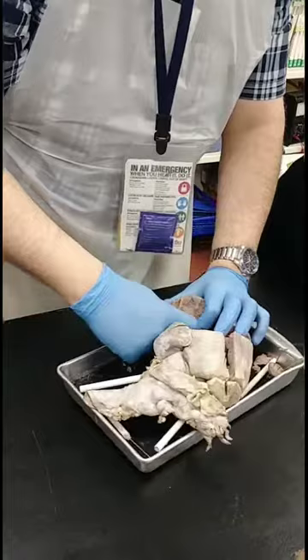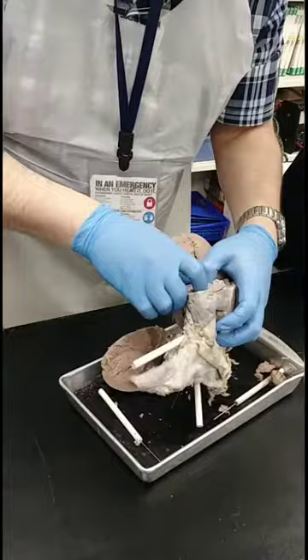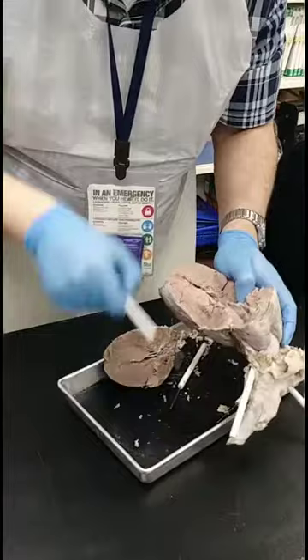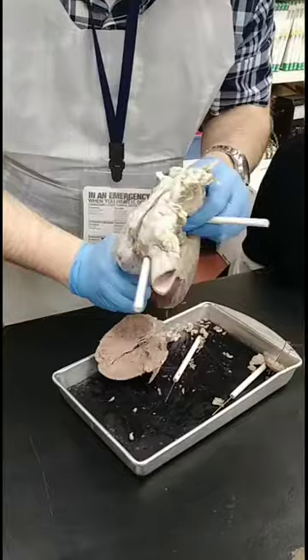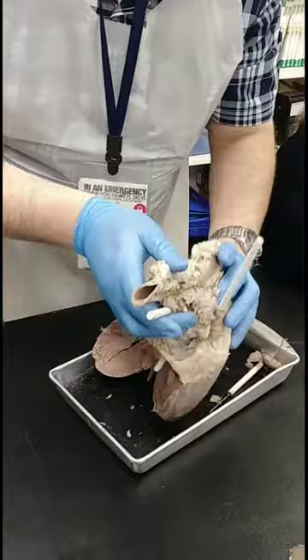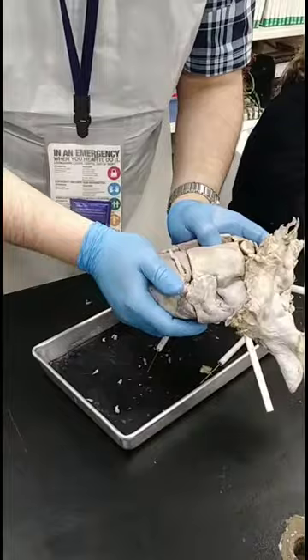Now on this side, take a look at where everything connects with the aorta, which is here. All right, this valve is going up to the aorta, which we can see. I'm going to poke all the way through. So we're poking through an artery wall. All right, and that continues up to the aorta. See that? This is part of the left ventricle. And it opens up, going all the way up to the aorta.